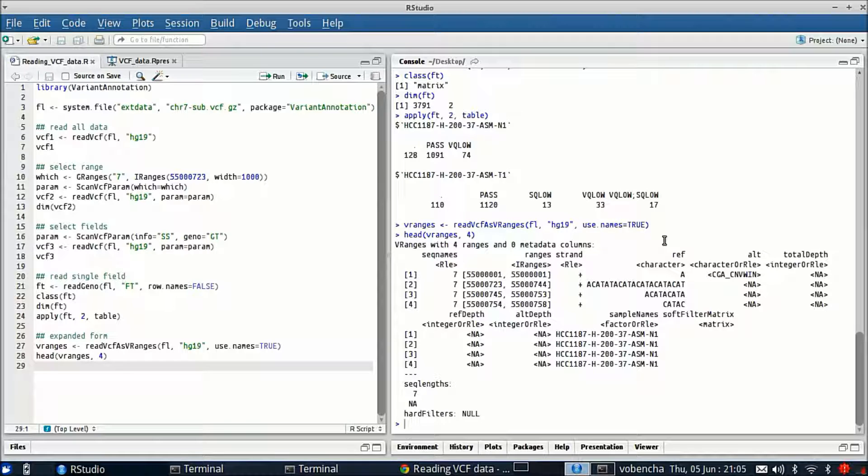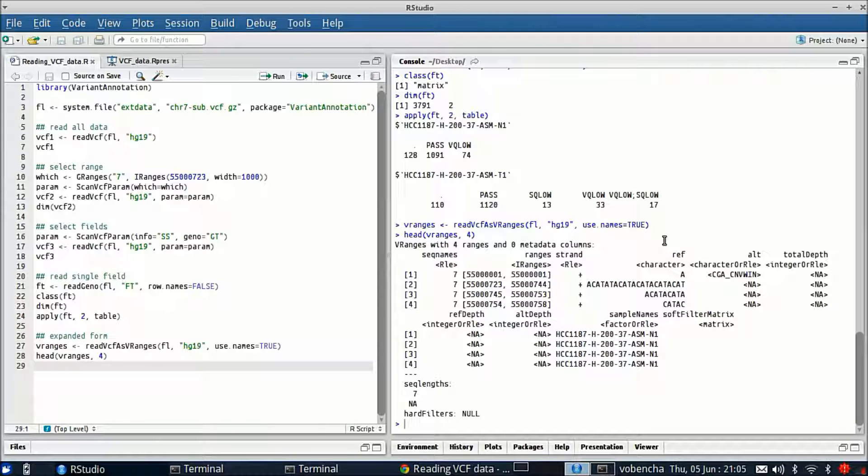But you can certainly change that by using a param and you can specify any info or geno fields that you want to bring in. It wraps the data out and expands it by sample.